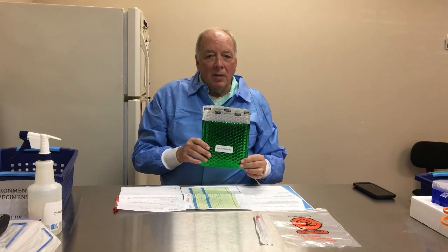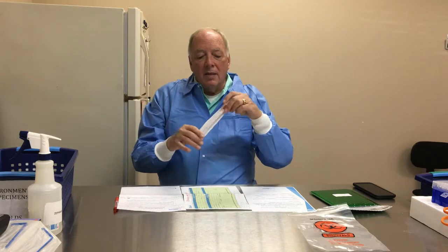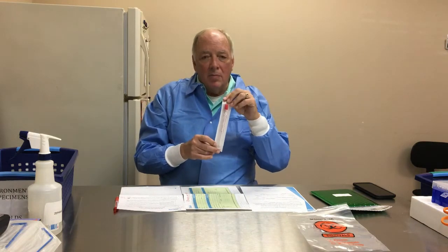To repeat: an envelope that may be green or another color but must say 'environmental' on it; a biohazard bag that we put everything in once we collect it; a sealed swab; and three sheets of paper.